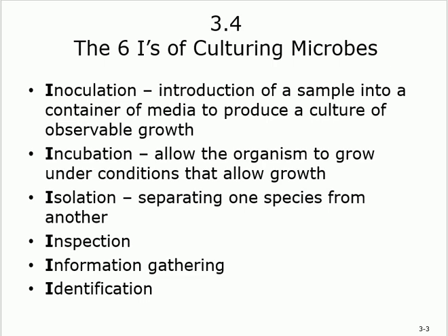Basically, inoculation means to inoculate something, meaning to get that sample of organism and you put it into a medium. Okay, this is inoculate, so introduce it into a culture.